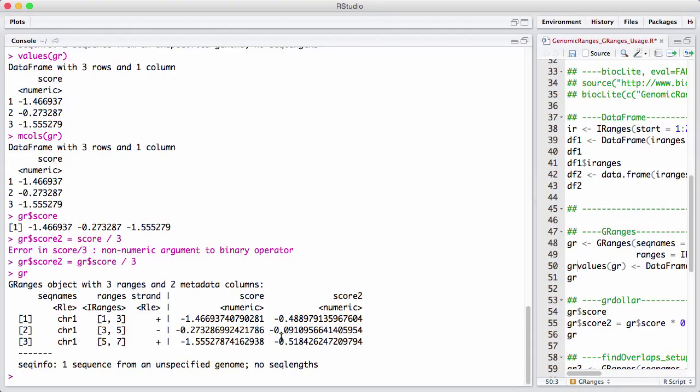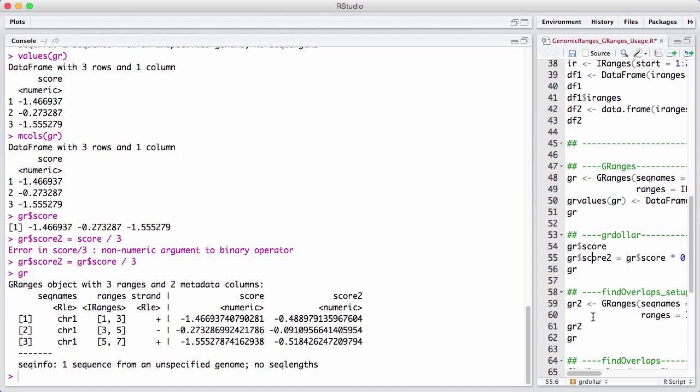The main workhorse of the GRanges class in the IRanges ecosystem, in my opinion, is the findOverlaps function. And it works, as we would expect, for GRanges as well.